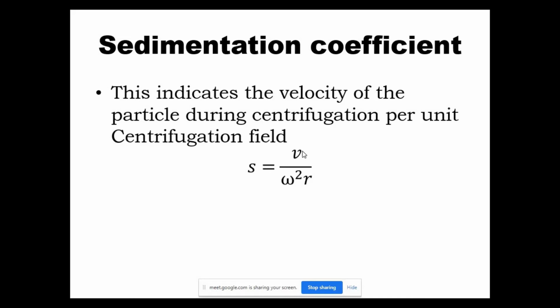Now, you have 16S ribosomal RNA and 23S ribosomal RNA. The density of the 16S ribosomal RNA is less than the 23S ribosomal RNA. So when you centrifuge, the 23S will sediment earlier than this one. Based on how much time it takes, or the speed of sedimentation of different RNA molecules, they are given some number.